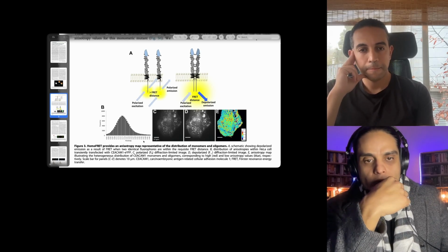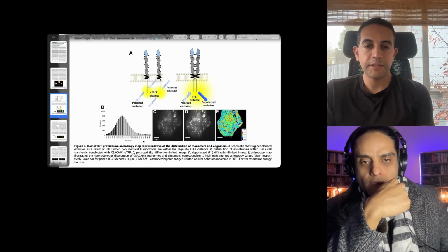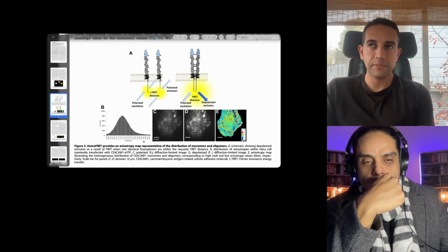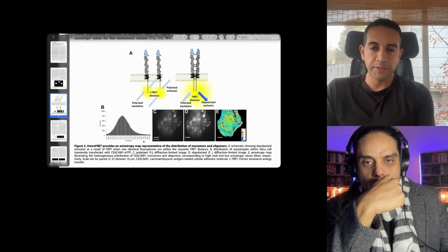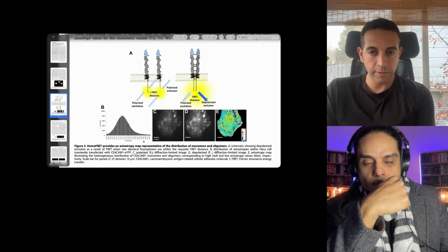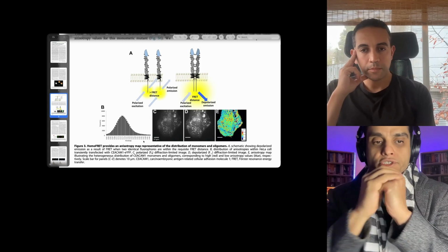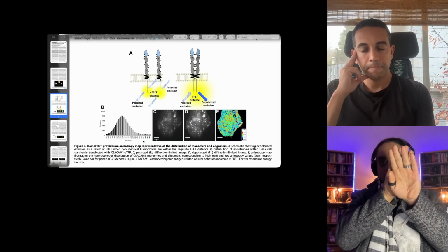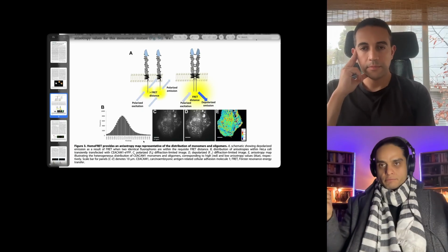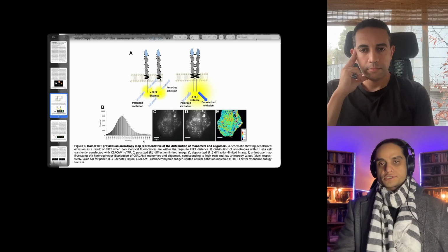Okay. And how do you use beads for that? Yeah, so you just make sure that you have some distribution of, or something structured, like let's say beads. You're imaging them in both cameras, and you're just moving one camera relative to another to overlap the two images. You have two images, and then you move the two images until they overlap, basically. So you have dots, for example the beads, and then the beads need to overlap. And this is how you calibrate before you start working.